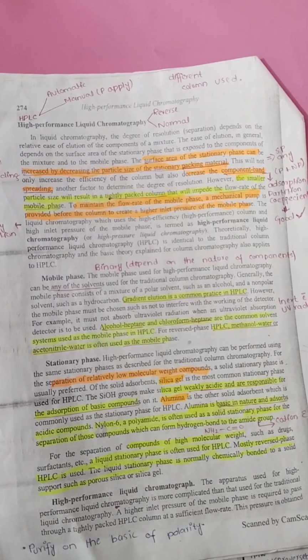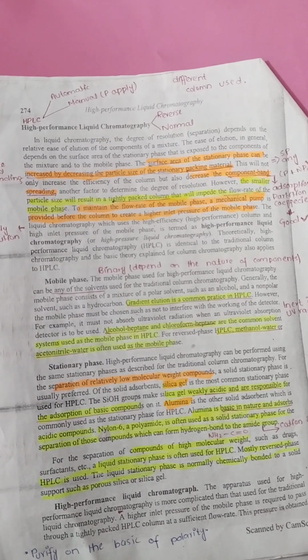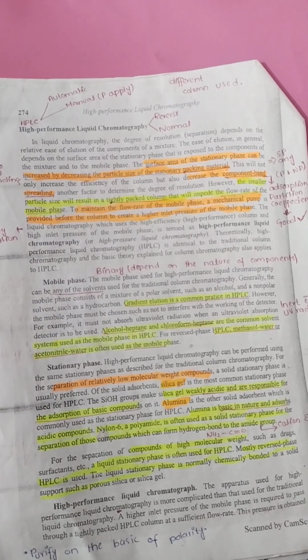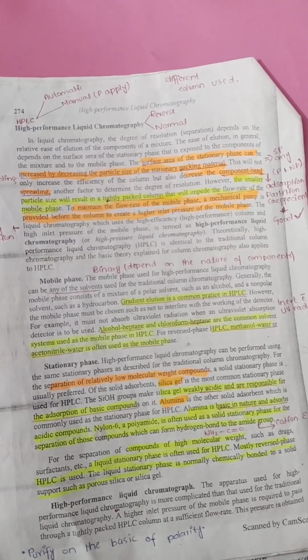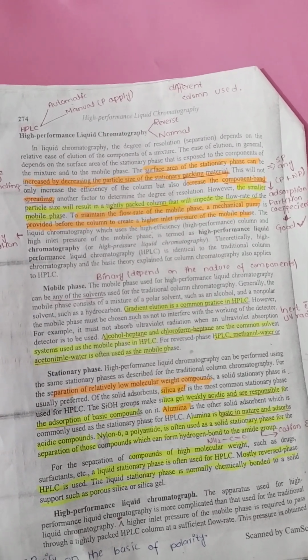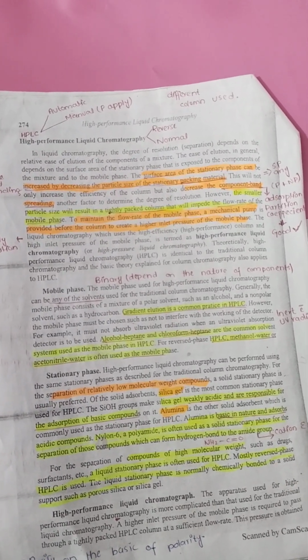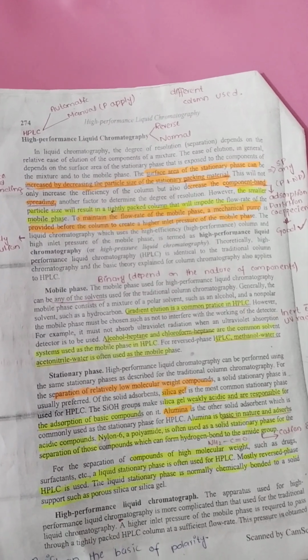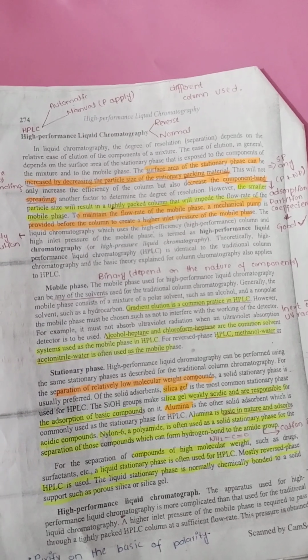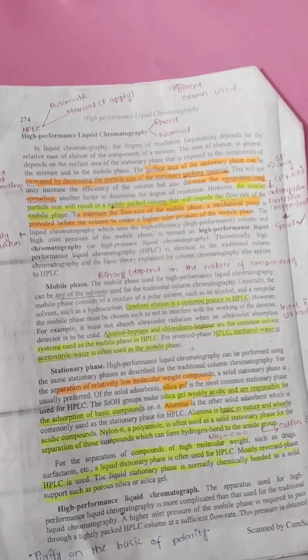If our particle size is decreased, it means its surface area increases, and if surface area increases, it causes two effects: one is it increases the efficiency of the packing material or column, and the other is it decreases the component band spreading. Decreasing the component band spreading means there is a good result showing in our detector.